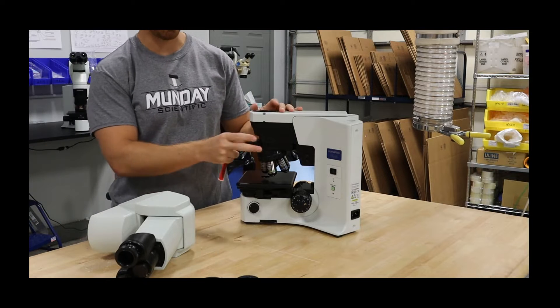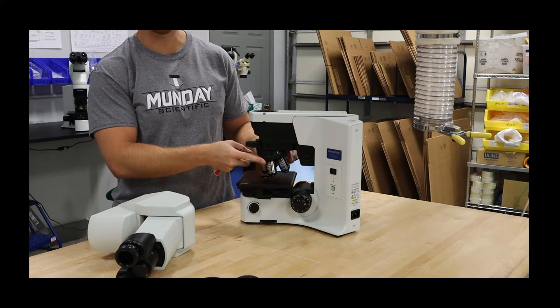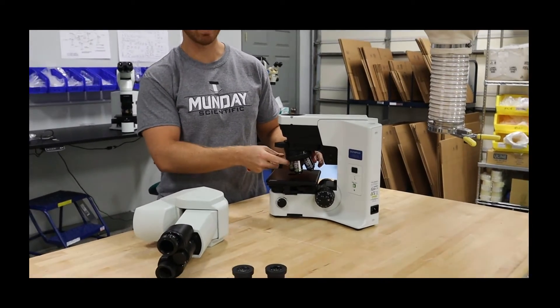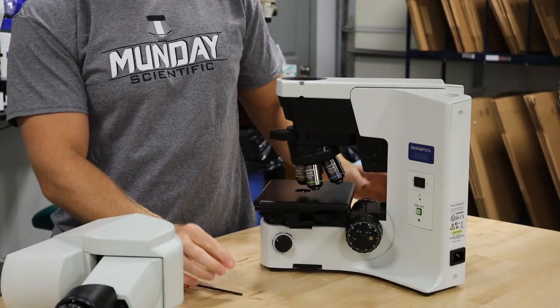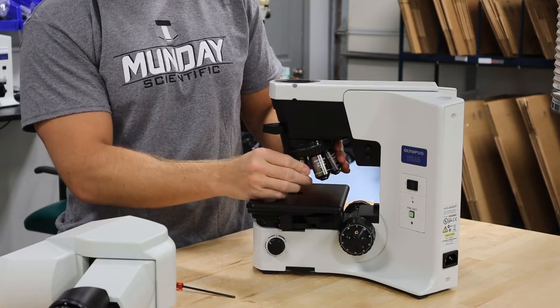On this particular scope, the nose piece does not come off. You want to get the weight off of this nose piece for shipping. So if you're disassembling it to ship, screw off the objectives. You can raise it with the focus, raise the nose piece, and then screw off the objectives.